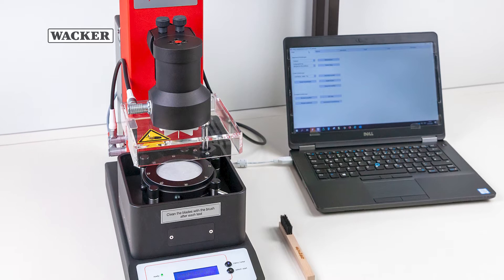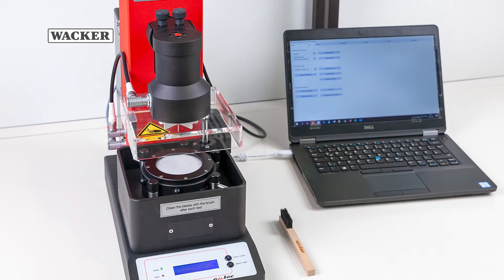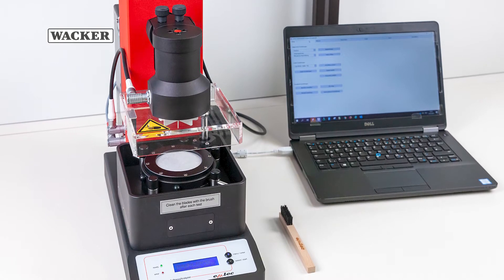The emtec TSA Tissue Softness Analyzer measures the softness, roughness, and stiffness of any kind of tissue.